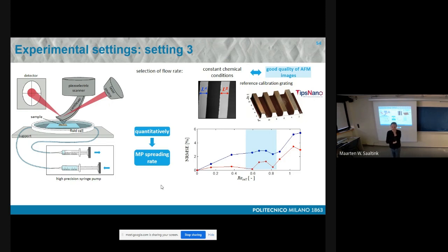Yeah, but the point is that the experimental observations, I agree, are very good, and what you say makes sense, and it doesn't change a lot. But you want to translate some kinetic parameters at the end to a set of chemical conditions that need to be related to saturation index. Then you need to know in the experiment where you are, and in nature at a given point in space the changes are not so big, but you need to know what rate values to apply to a given set. For that, I think the experiment does it.